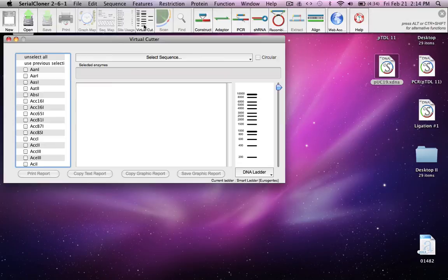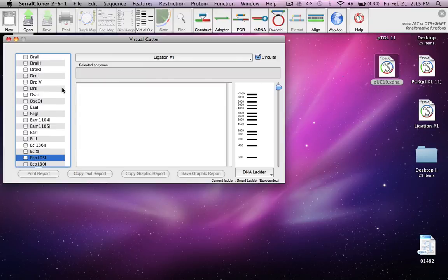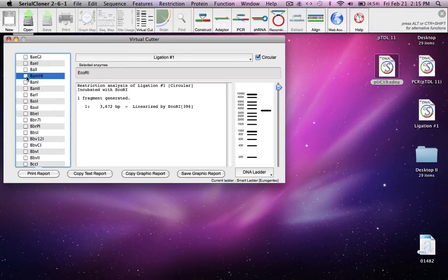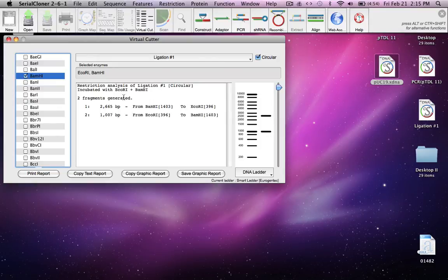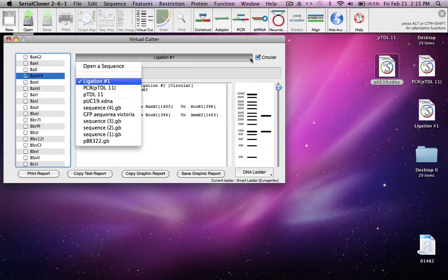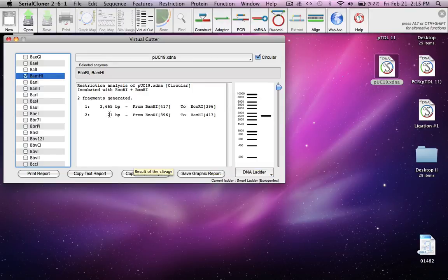You can also do a restriction digestion to confirm the cloning. Open virtual cut from the top panel, select our construct ligation number one as the DNA to cut, and cut it with ECO R1 and BAMH1 — that should excise gene Y. We get two fragments: a large one which is the PUC19 backbone, and a smaller one which is gene Y. To confirm, we can cut PUC19 with the same enzymes BAMH1 and ECO R1, and the large backbone fragment is exactly the same size as what we got when we digested our construct — confirming successful cloning.